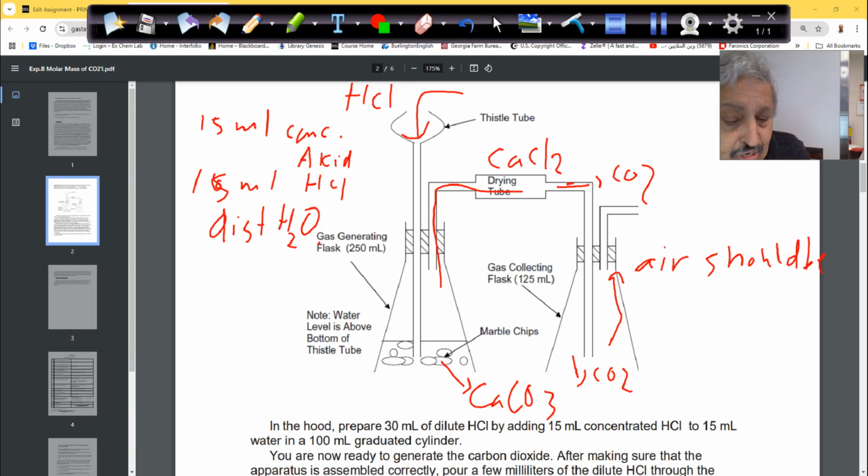Okay guys, after that, you'll generate another 10 minutes just to make sure of your weighing, because you have to take it. But before you start, that's the source of error. You have to make sure this connection here is really dry.